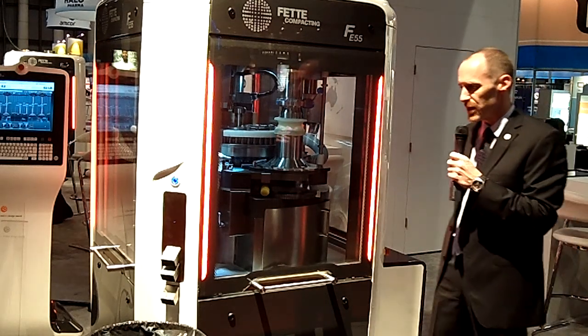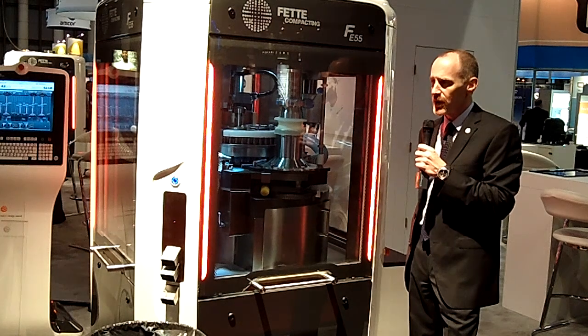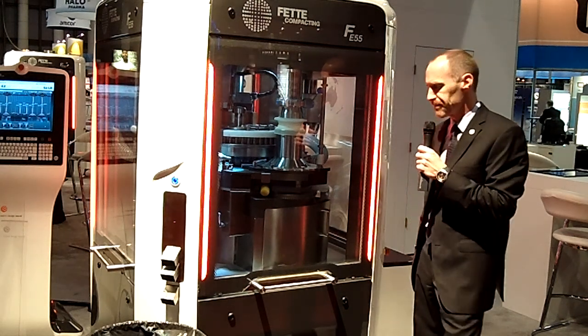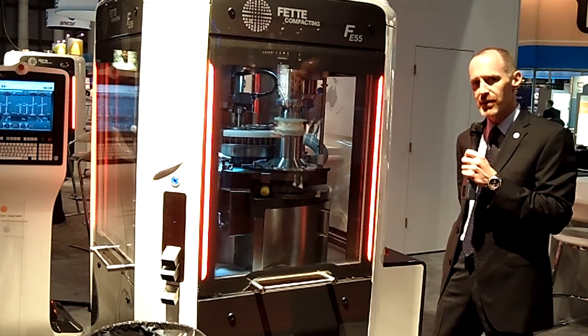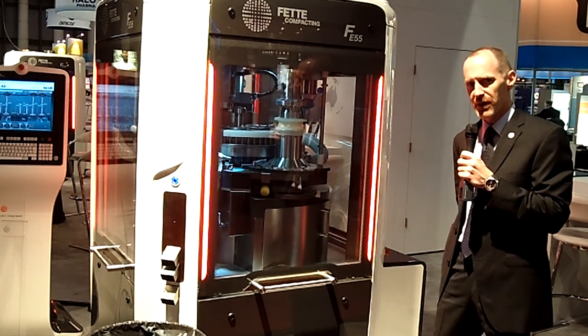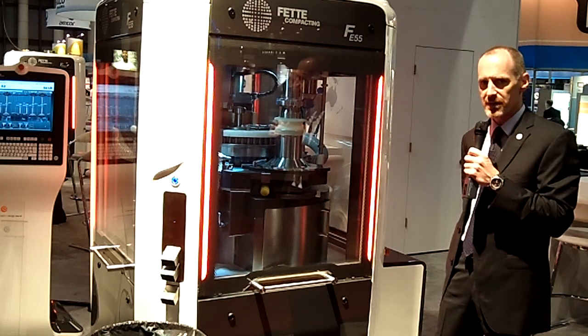As I go through this brief demonstration, if you would keep in mind the two primary design criteria that Fette Compacting utilized while developing the machine — those of efficiency and the Tri.Easy concept — Tri.Easy representing the simplification of the three primary aspects of tablet press use: those being changeover, operation, and maintenance.